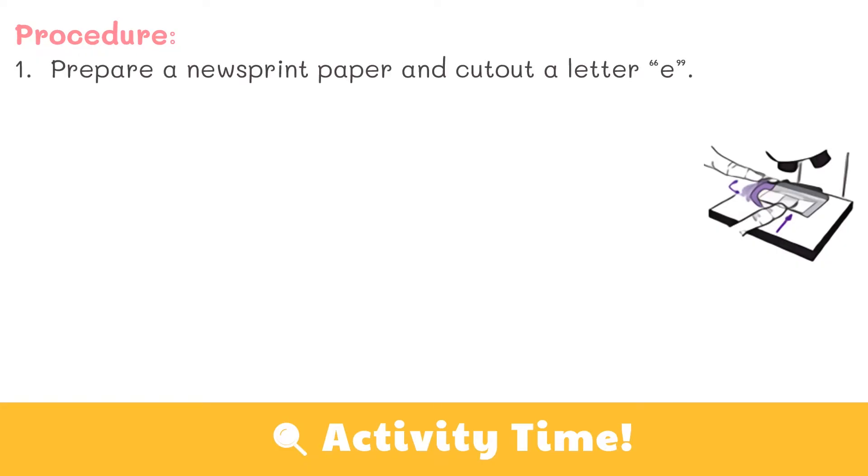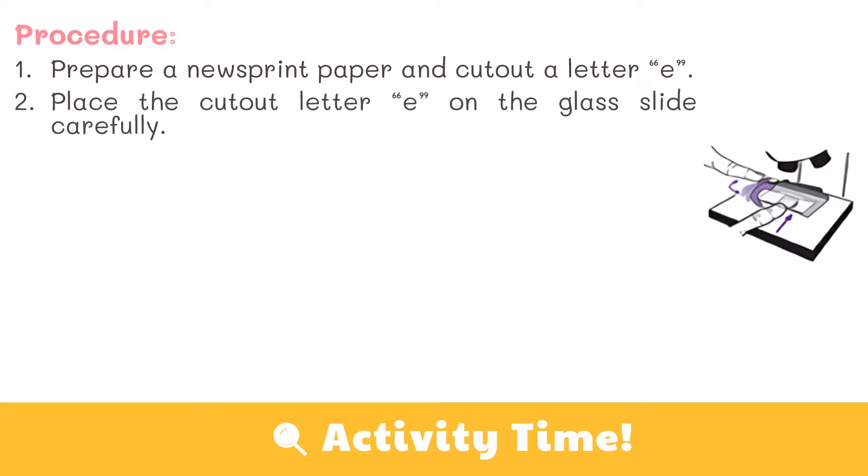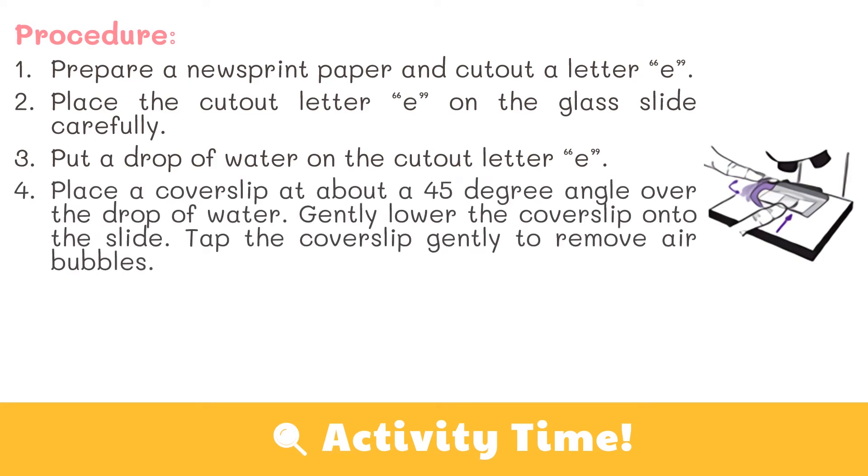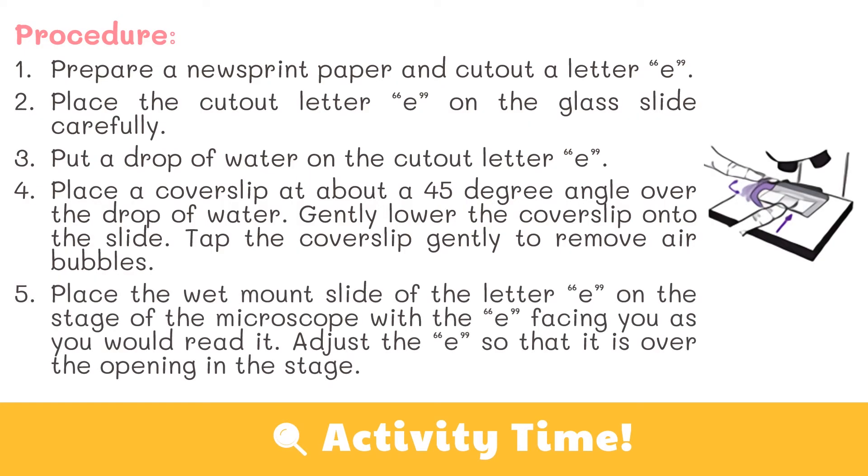Now that you're ready to use the microscope, let's do this activity. Prepare a newsprint paper and cut out a letter E. Place the cutout letter E on the glass slide carefully. Put a drop of water on the cutout letter E. Place a cover slip at about a 45-degree angle over the drop of water, then gently lower the cover slip onto the slide. Tap the cover slip gently to remove air bubbles.